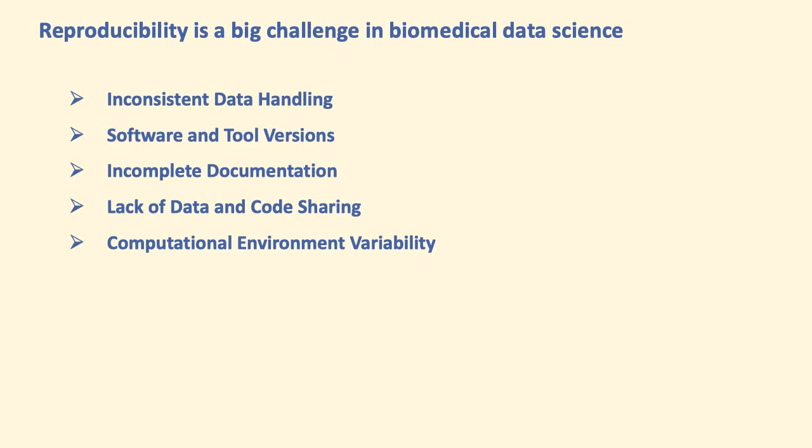My topic today is about a JupyterLab extension that we have developed to connect two different platforms. The first thing I want to talk about is the issues that most of the time biomedical informatics researchers experience during their day-to-day job.